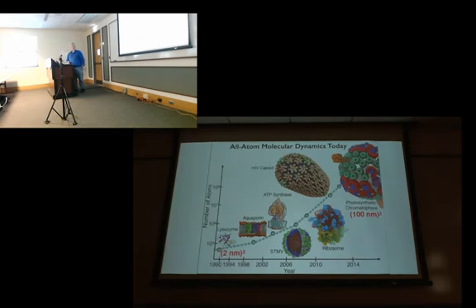And the reason why you care about this is, if you look at the history of the simulations done by this research center, this is a plot of the different key structures that this center has published its work on going back 20 years. You can see that the size of the resolved structures has increased by orders of magnitude. The latest work is in the range of 100 million to billions of atoms. And this isn't motivated by the availability of computational machines as much as it is being driven by the availability of experimental structures.